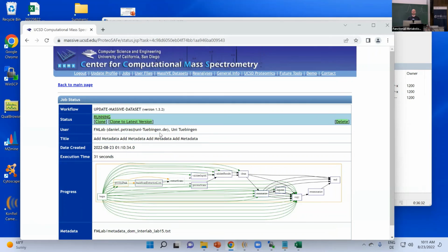And honestly, when reviewing papers and seeing in the data sharing section that all this source data is publicly accessible, that adds a ton of transparency. And that indicates that, first of all, people knew their stuff, and they actually care that you can reproduce what they did. And unfortunately, often it's not the case. Some processing happened, and there may be a final output table in Excel, but how they got there is kind of a black box. I hope that this really adds transparency there.